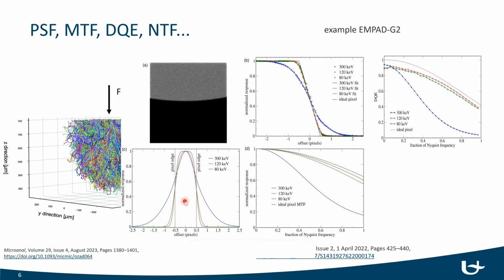If you Fourier transform this point spread function, you get the so-called modulation transfer function, which you see here. And you see the dotted line is what an ideal detector with square pixels would look like. So you have a response which tapers off a little bit to higher spatial frequencies. And you see how close this camera gets between 80 and 120 kV, how close it gets to ideal. And this is why 4D STEM is really happening now. We have detectors now that are almost like a quantum operator of a measurement, basically. They come very close to the very best you can hope to get.